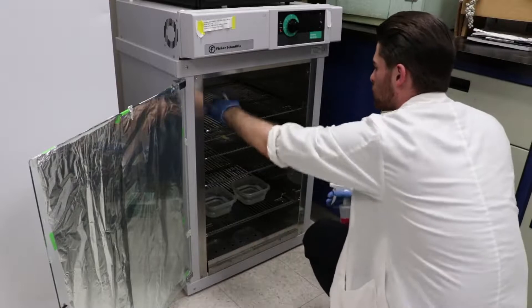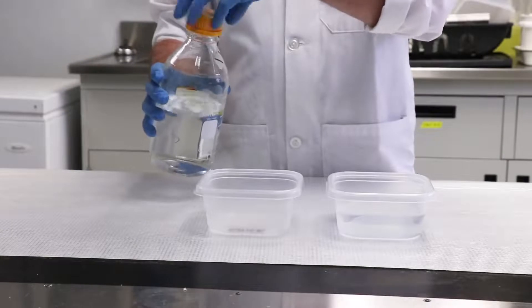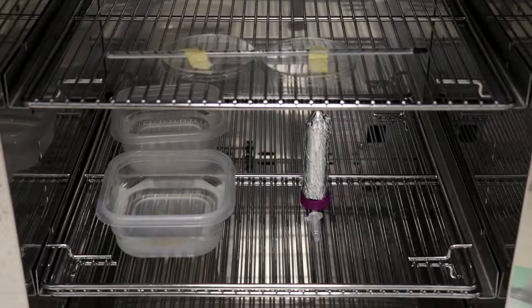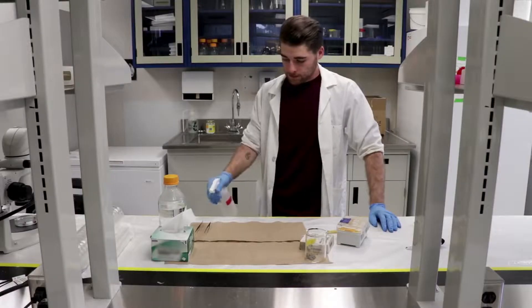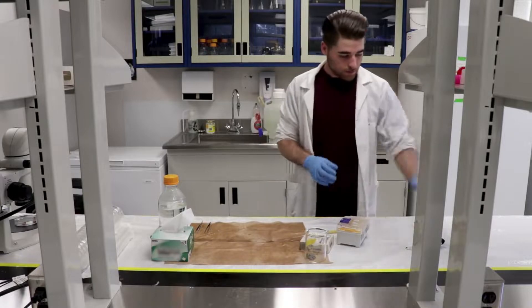Thoroughly sterilize the incubator shelves and door using 70% ethanol. Then fill the containers with autoclaved distilled water and preheat the incubator to 37 degrees Celsius. Pre-warm the nutrient medium along with a tube of the antibiotic penicillin streptomycin in the incubator. Lay paper towel across the workspace and sterilize with 70% ethanol, then sterilize all forceps and scissors.